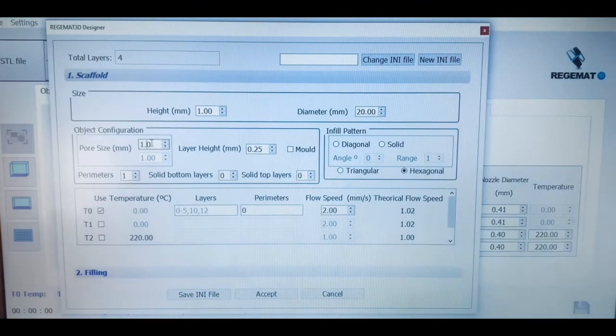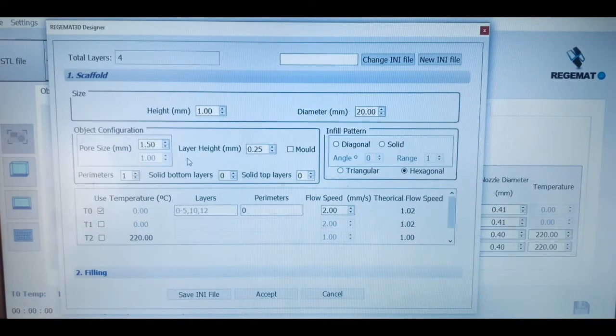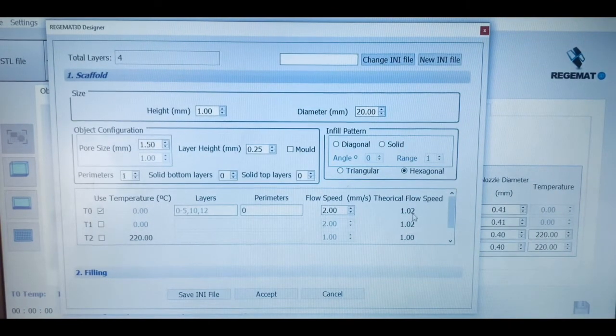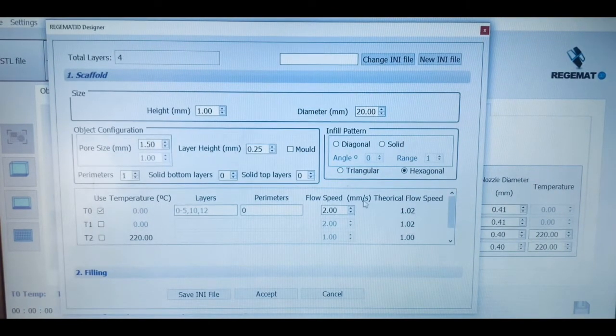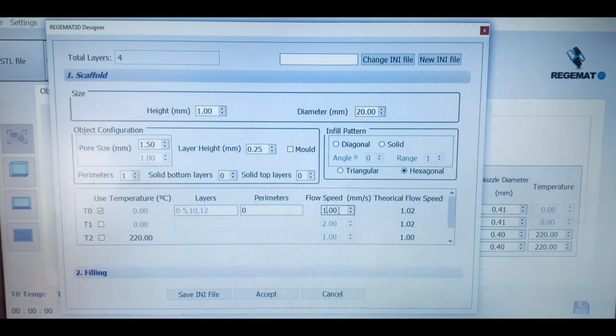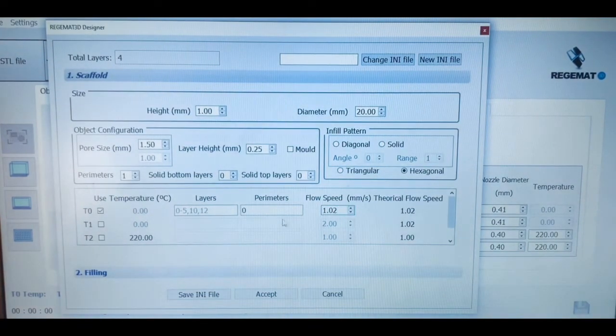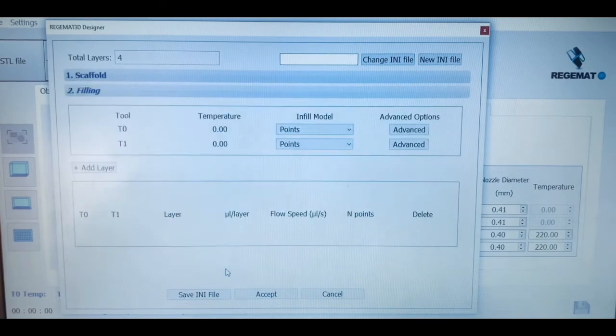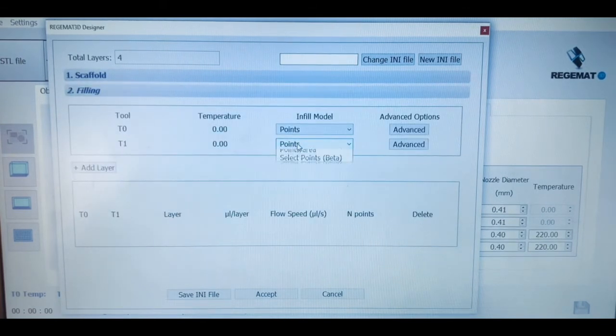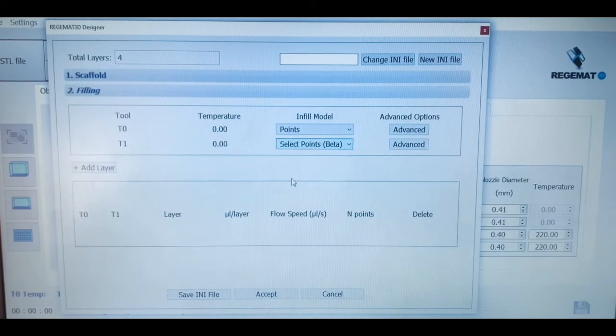The software will also tell us a recommended flow speed according to the nozzle diameter, layer height, and printing speed that we have previously selected. However, we can manually introduce it according to the composition, the viscosity, and the mechanical features of our bioinks.